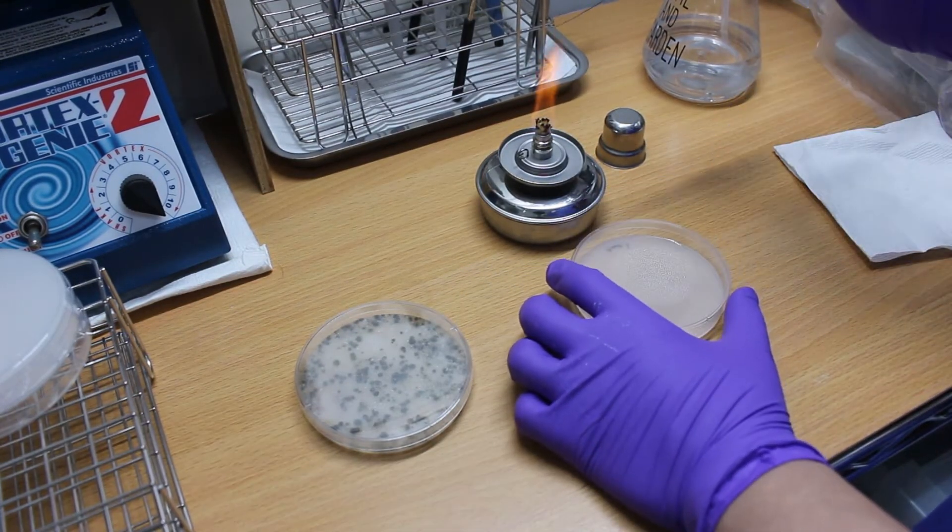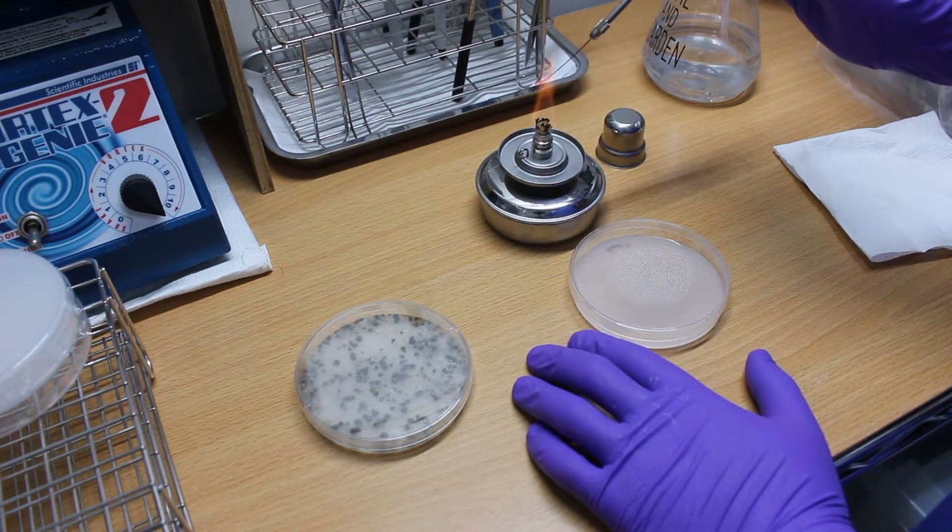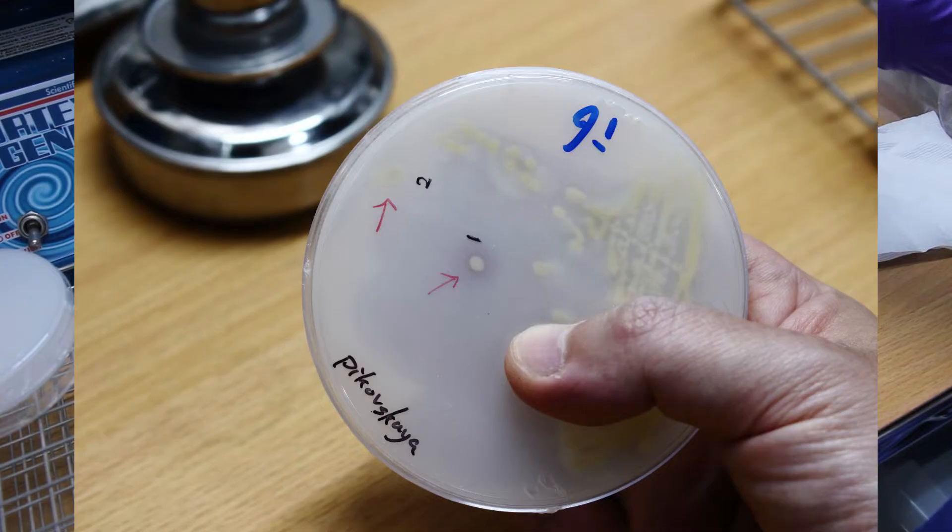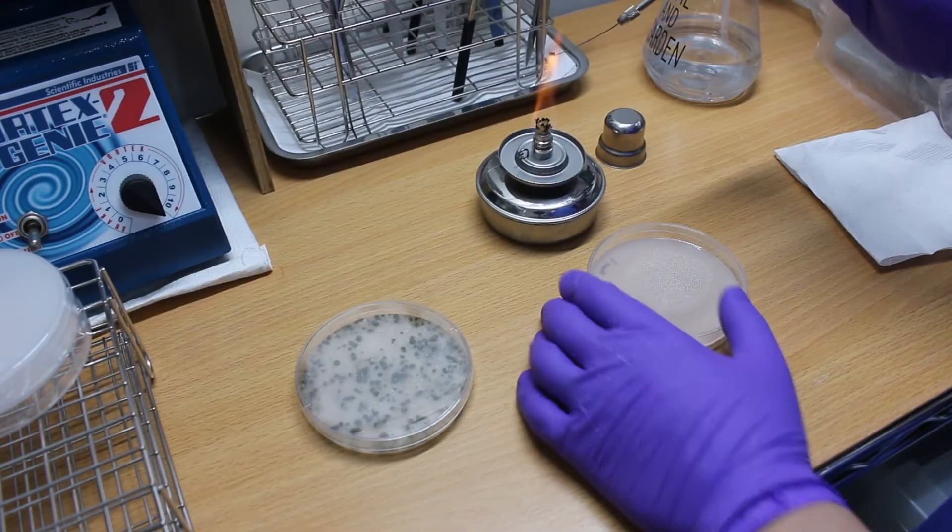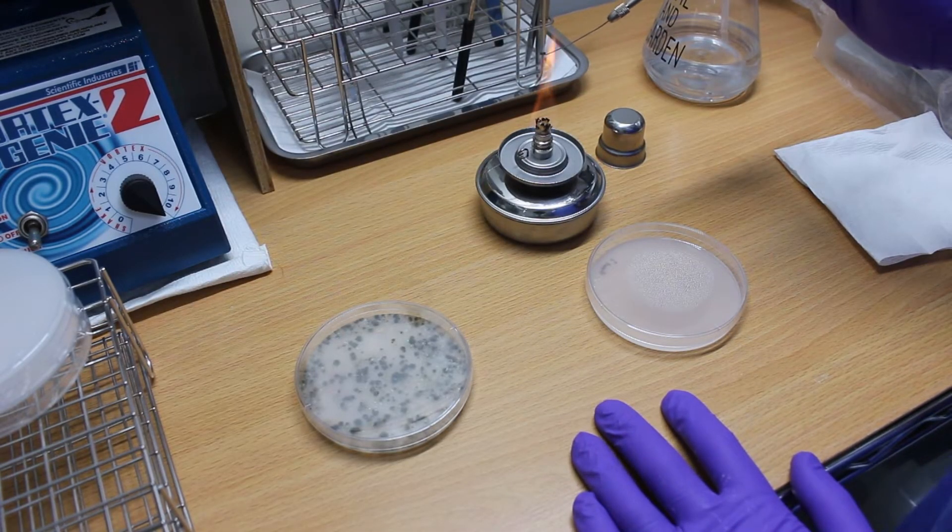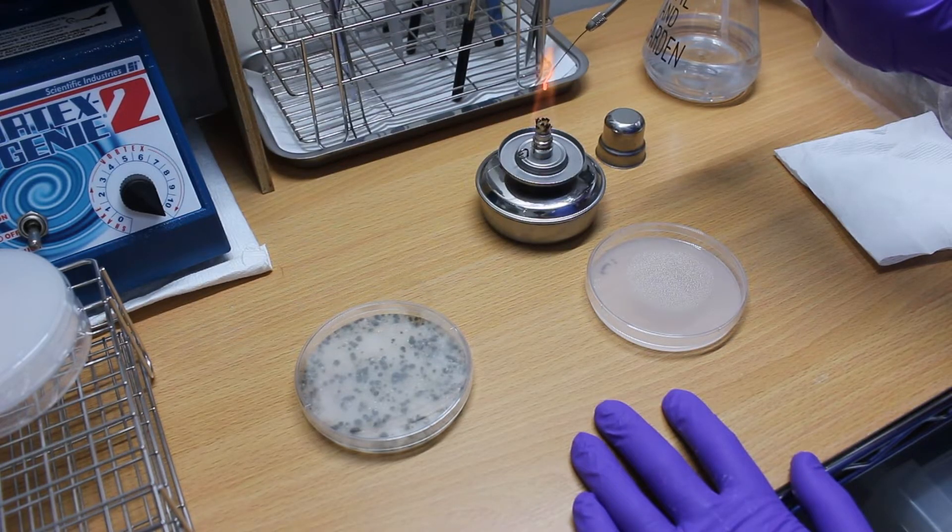If everything goes as planned, after the culture, we will obtain a pure single colony that should look like the one in the video, and the transparent ring will be more visible. At this point, we know that we have successfully isolated the phosphate solubilizing bacteria.